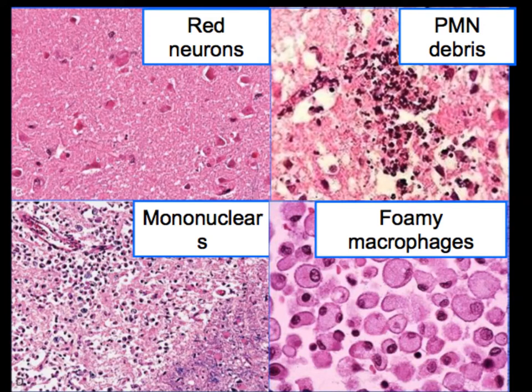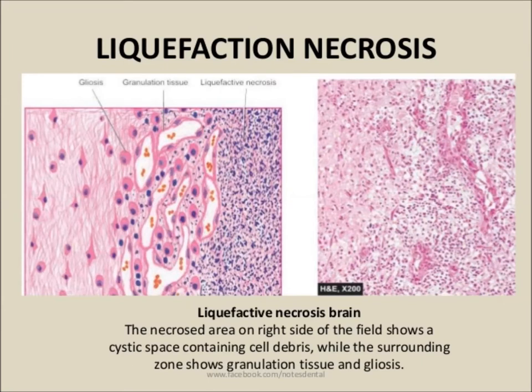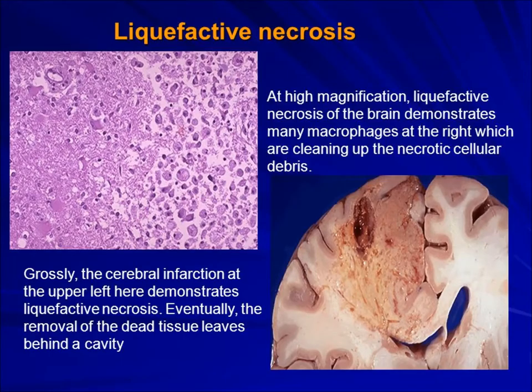After a few hours, there are polymorphonuclear leukocytes, then mononuclear cells. Mononuclear cells consist of macrophages, lymphocytes, and plasma cells. They are replaced by foamy macrophages because they clear the debris. Here you can see foamy macrophages, and in the center there is liquefactive necrosis.